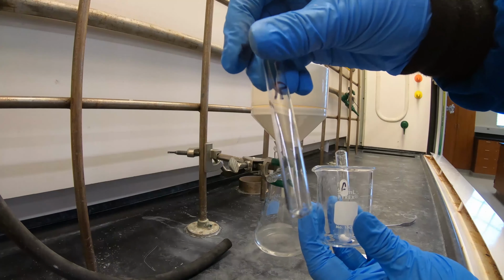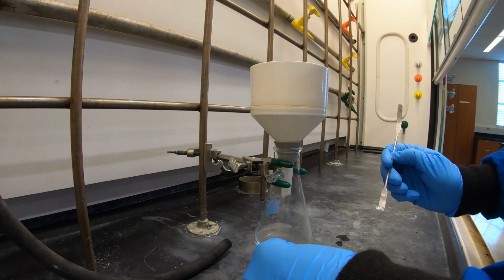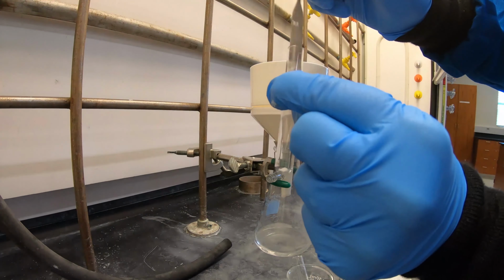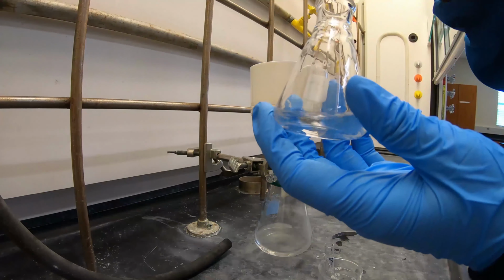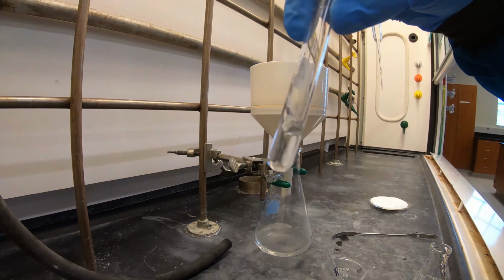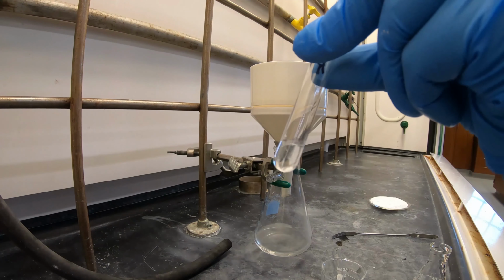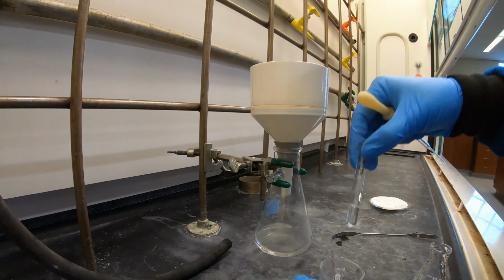Place a small amount of our purified aspirin into a small test tube. We are now going to prepare our samples for TLC. So you're going to add DCM to dissolve this purified aspirin sample, and you're also going to dissolve the crude sample that you set aside earlier.